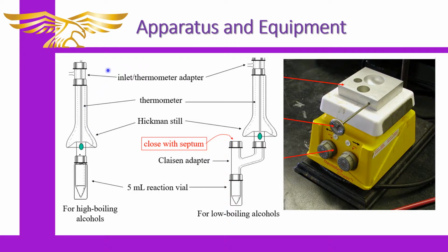Though these pictures are from one of our older slide sets, it is important to remember that you will need to follow the instructions in the lab manual with regards to how to place the lollipop wand thermometers through these apparatuses to measure temperature, should temperature measurement be required. Sometimes we don't always have to use a thermometer.